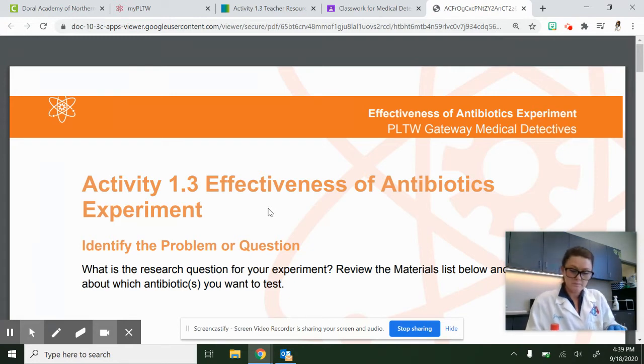All right, so partner number 2, you're going to take some isopropanol and you are going to have an empty Petri dish. And in your empty Petri dish, you're going to take the lid, and the lid is where you're going to be putting your antibiotic disc. So you're just going to set that aside. And then you're going to take the bottom part of this Petri dish and you're going to fill it up with a smidge of isopropanol alcohol. That was a technical term, just so you know.